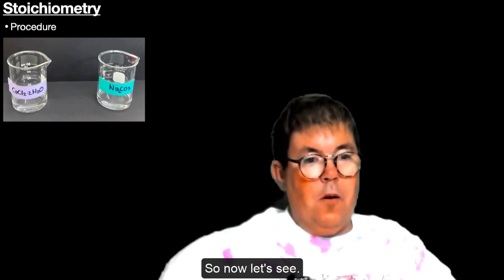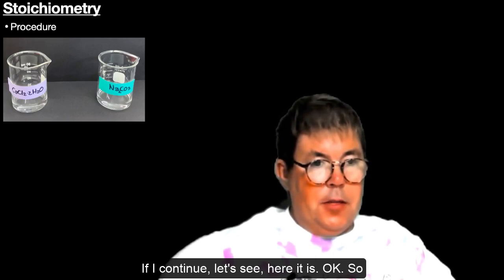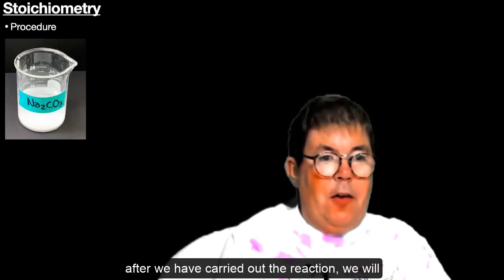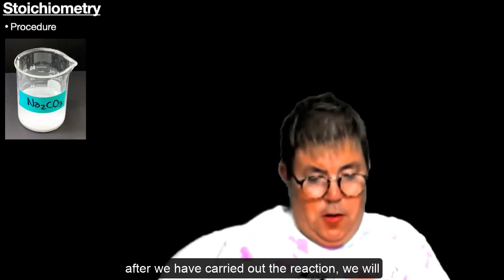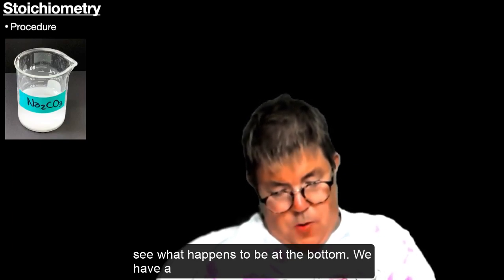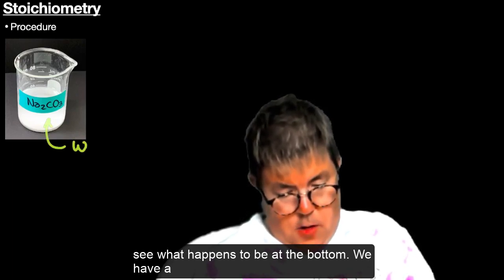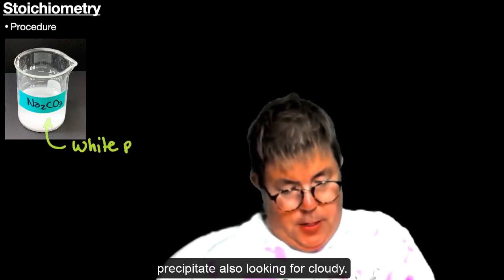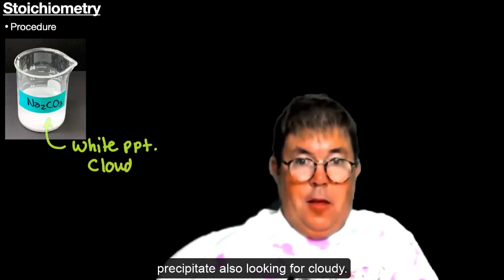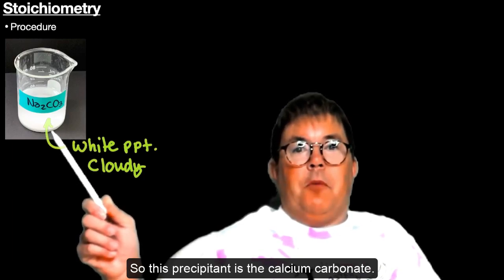After we have carried out the reaction, we will see what is at the bottom. We have a white precipitate, also looking cloudy. This precipitate is the calcium carbonate.